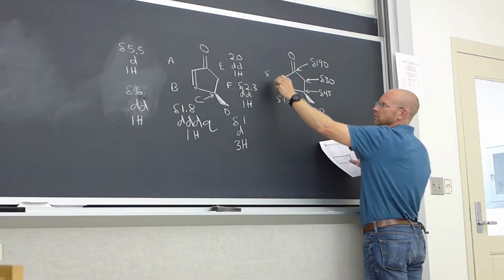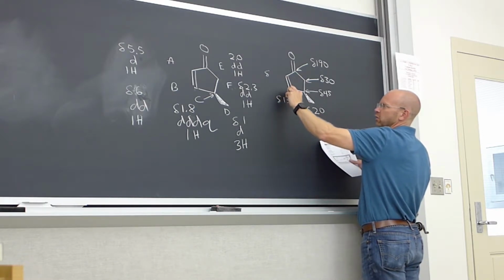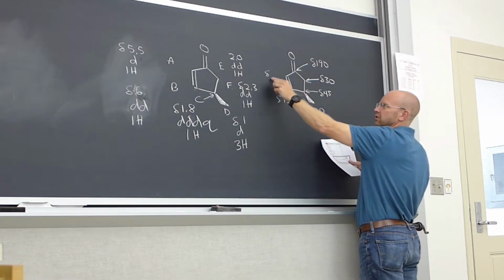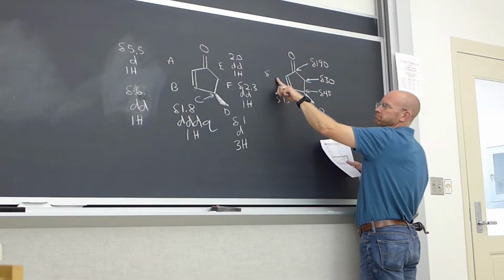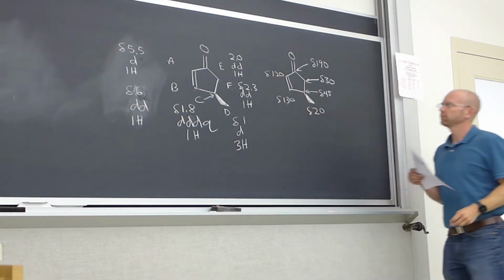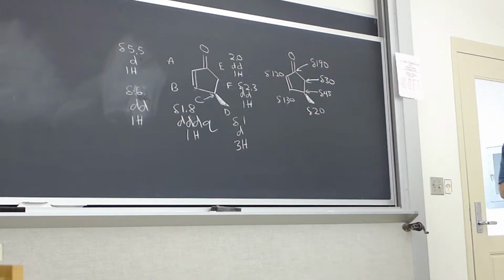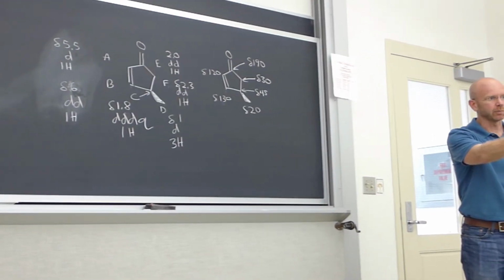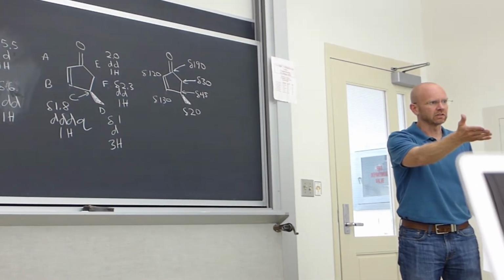And 60. Again, this is going to be more deshielded probably, because of resonance, so maybe this is actually going to be 100. Yeah, like 120. Okay? All right? Everyone see how to do those things? Oh, I got it. That's on camera. So ChemDraw is going to now predict those spectra for us, and we're going to see how well we did.